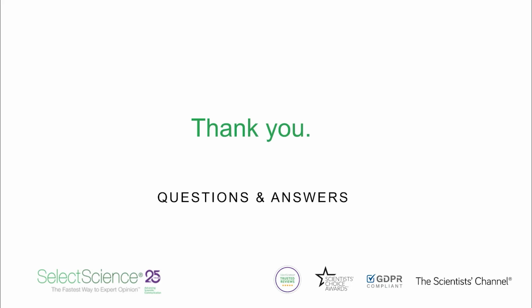Great, thank you for clarifying that for us. So the next question we've had in is, which mode do you recommend between basic mode and advanced mode under the FL counting option when counting intact cells?